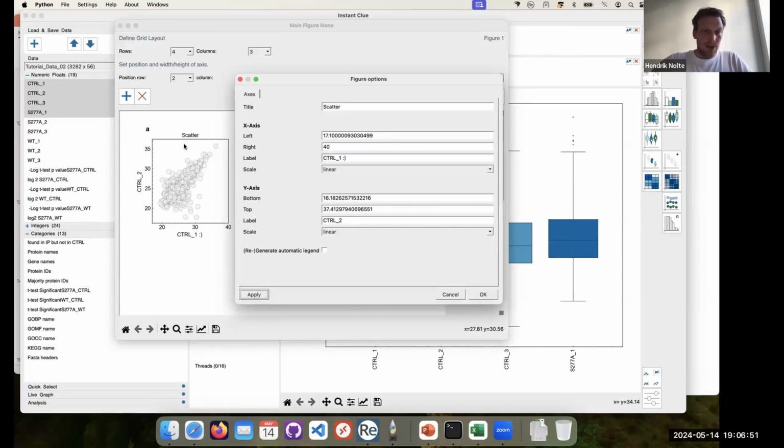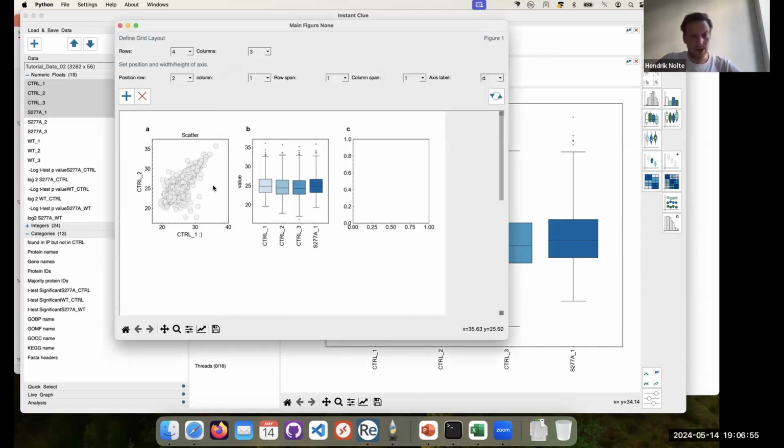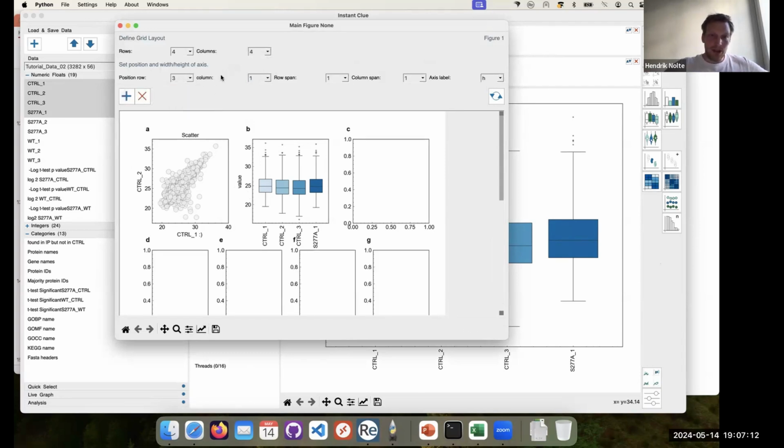We can just apply it, and these things we can change, but we cannot change something like, okay, adapt all the charts to the same axis limits and so on. And you can, of course, also mix different grids. So let's say we want to add a smaller one. We can do that simply by changing the number of columns, since then the A4 page is divided into more columns, and that allows us to create smaller axes.